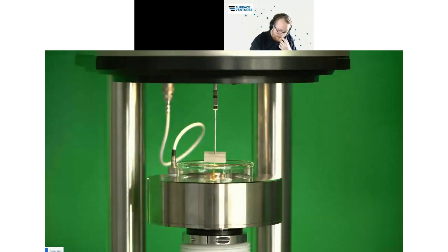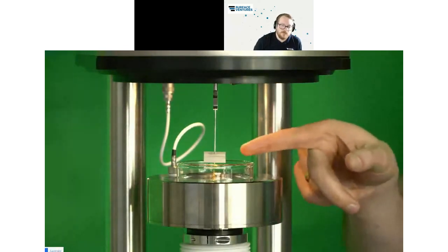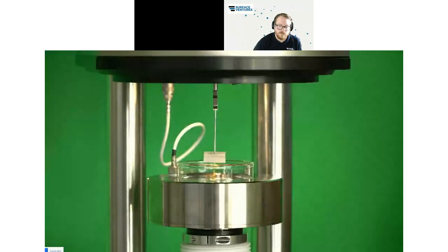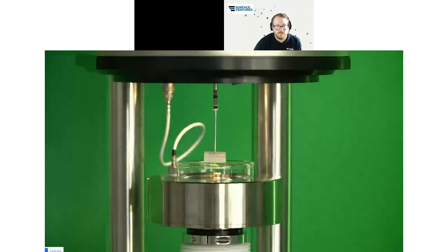Because you notice platinum iridium, this is a very powerful catalyst in organic chemistry. So when you heat platinum iridium up, every organic residue on the surface will be decomposed. And this is very important because if you have still some surfactant on the surface and you heat this blade up, it will burn off and then you have a clean and neat surface again.